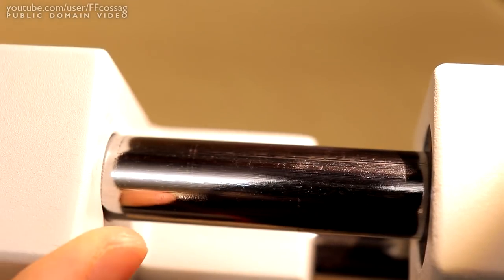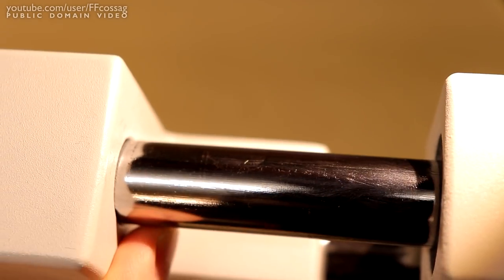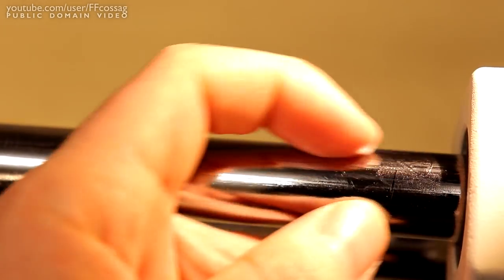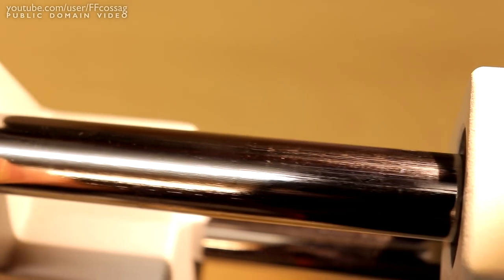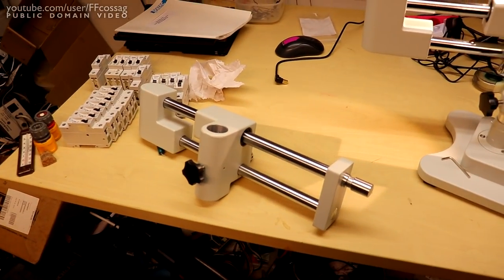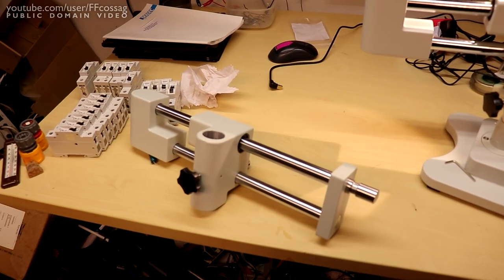You can see this is just completely dented. It's got these lines running where the bearings rest. You can see there's a really deep run there. Hopefully this one is going to be better, and I would bloody well expect it to be because this issue has been known for about five years.